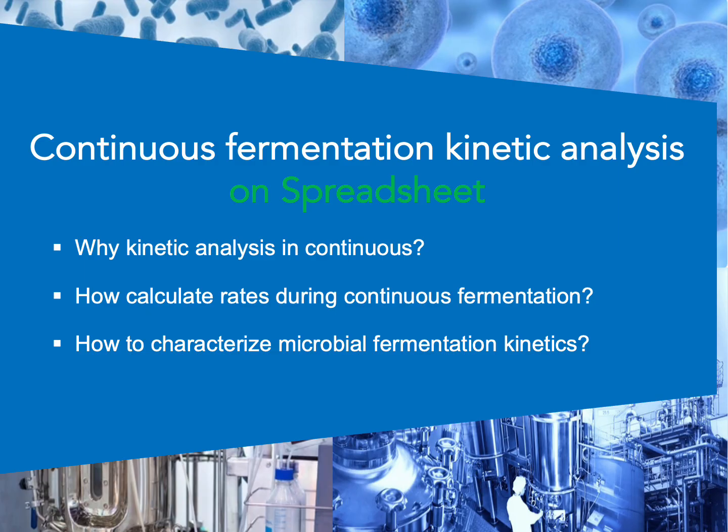In this tutorial, you will use a spreadsheet to analyze the experimental kinetics of microbial fermentation operated in continuous mode. You will learn why continuous fermentation is used, how to calculate microbial rates during continuous fermentation, how to characterize microbial fermentation kinetics.